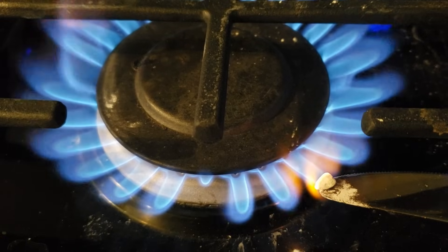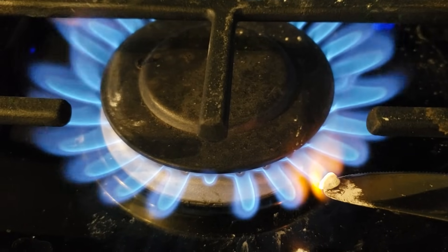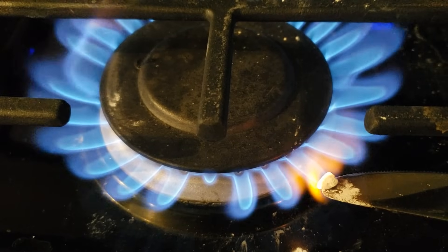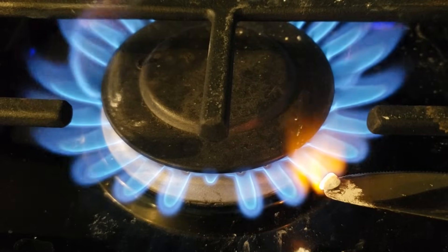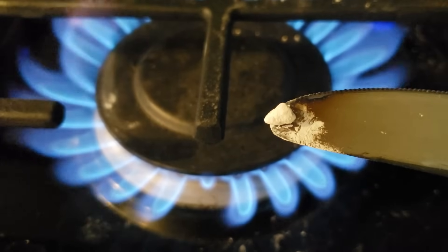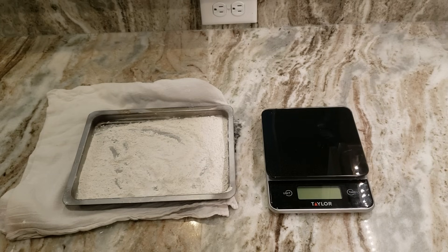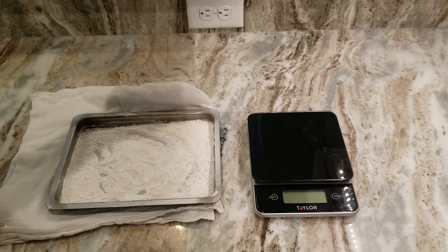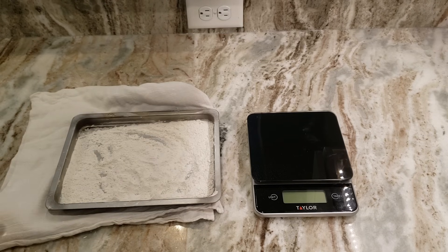One really easy way to tell whether we got all the sugars and organics out of our product is to take a sample of it and put it up to a flame. As you can see here it's getting red hot without anything actually burning off of it — it's perfectly white even after that heating. Here is our final dried product: a pretty fine powder. It's not a hundred percent dry but it is as dry as we need for this application.